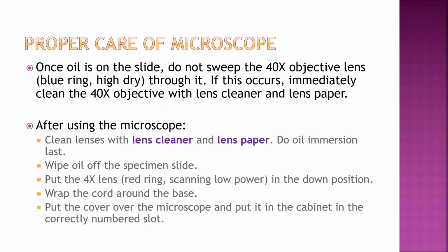Once the oil is on the slide, you do not swing back to the 40x objective. If you do that, you need to make sure that you clean all of the objectives. That oil will cloud the objective if it's left on there. So this is why we don't use it in our other classes, because it's just one more thing to manage, and someone might accidentally use the oil immersion lens with oil. So we just make sure they're not on there. If you get oil on any other objective, you want to get it off immediately.